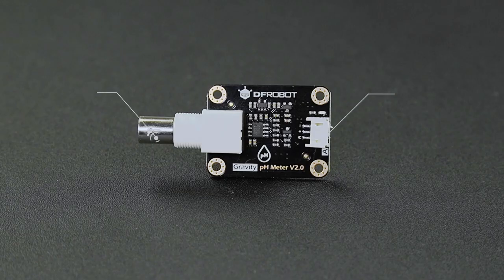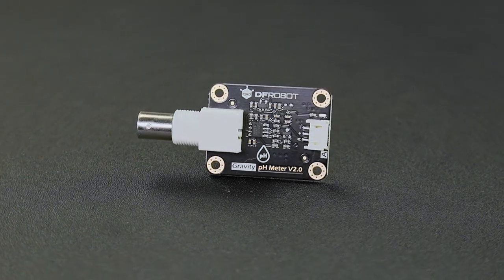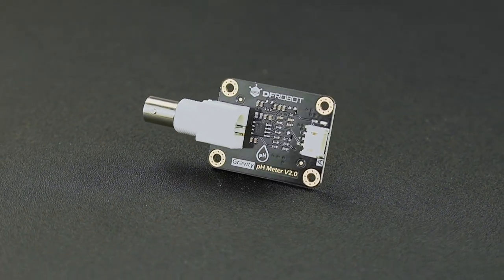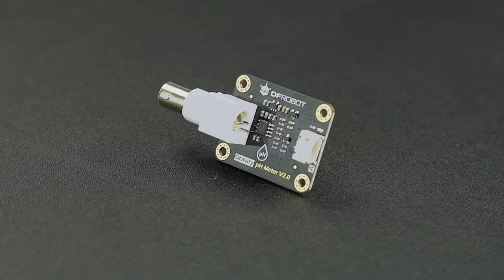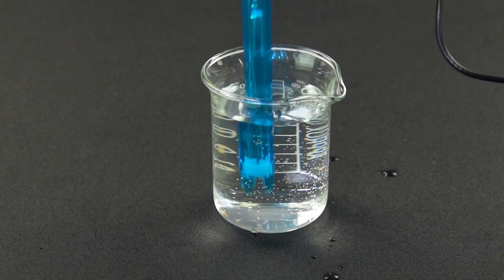The equipped signal adapter comes with BNC and gravity interfaces, plug-and-play, no soldering required. Besides, the sensor output is filtered by hardware and has a low overall jitter. With the pH sensor, you can easily detect the pH of a solution.